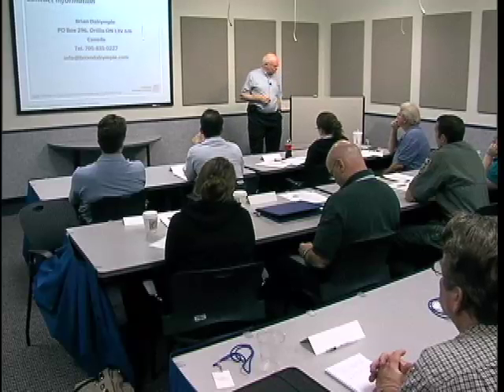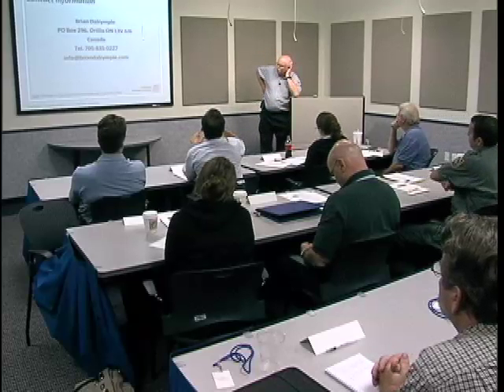Leslie asked during the break if there was any development towards a laser that would give you a tunable monochromatic output, so that you just twist the button and go from a 460 single line to a 505 single line to a 575 single line. One of the short answers is there hasn't been enough critical mass to drive that, because companies don't want to spend a ton of money they don't know for sure they're going to get back.